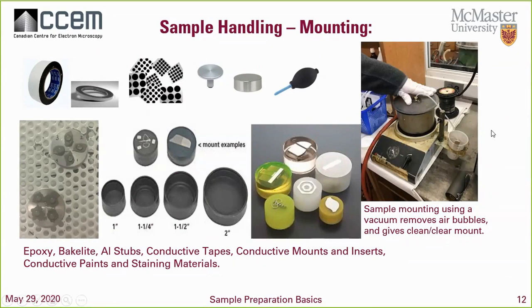If you wanted to look at a cross section of the semiconductor, you might have to go to FIB to get something really well for that. So hopefully that answers your question. I think you need to be a little bit more specific, because in SEM you can pretty much look at it in cross section or just planar view. So hopefully that answers the question.